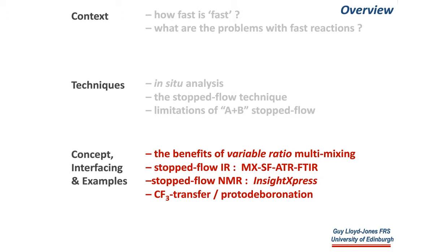And then we'll move through to working at how one can interface that with infrared for a new stop flow infrared system, and also then with NMR for the so-called Insight Express. And to illustrate some of the benefits of this, I'm just going to show you a few graphics of kinetics we've obtained in two reactions, one of which being CF3 transfer, trifluoromethyl transfer, and the other protodeboronation.